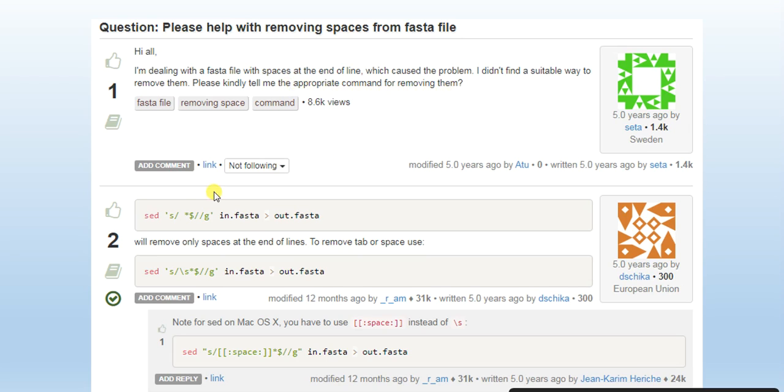Or will remove only space at the end of the line to remove tab or space. So this type of problem comes, and this video shows how to remove the space between sequences and also numbers.